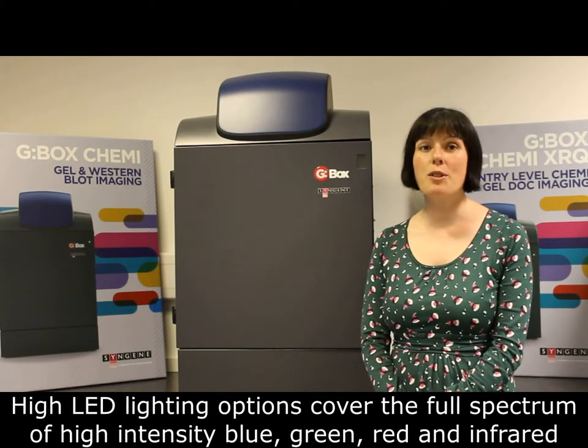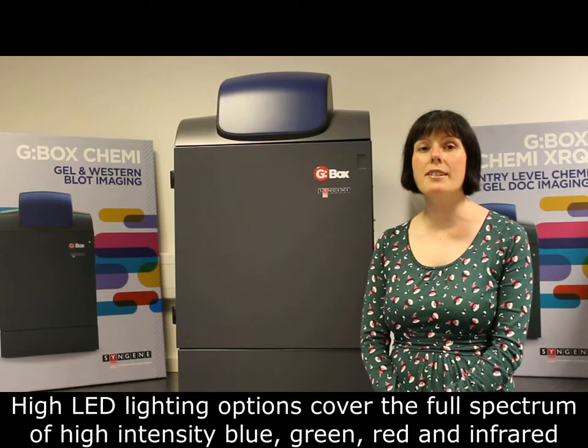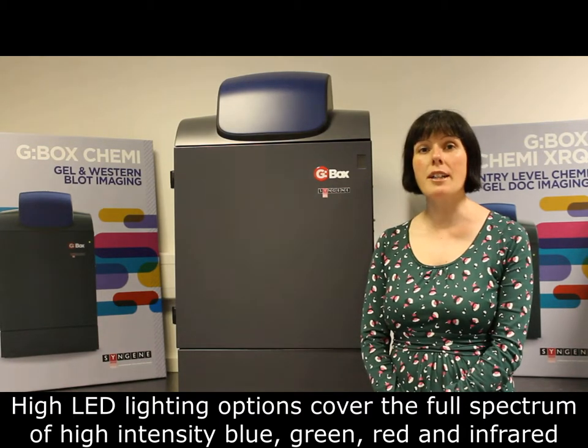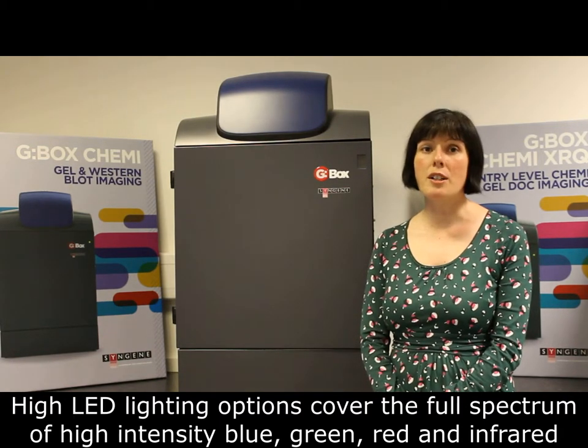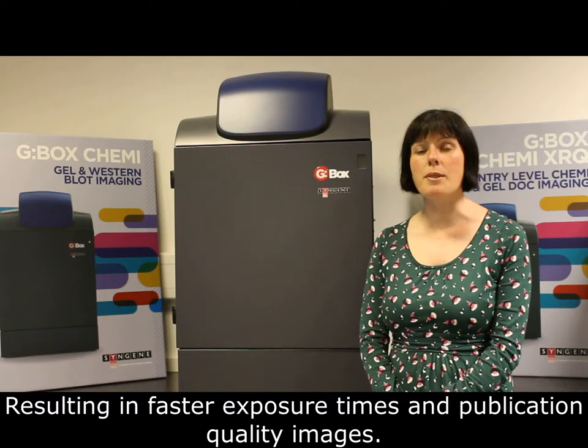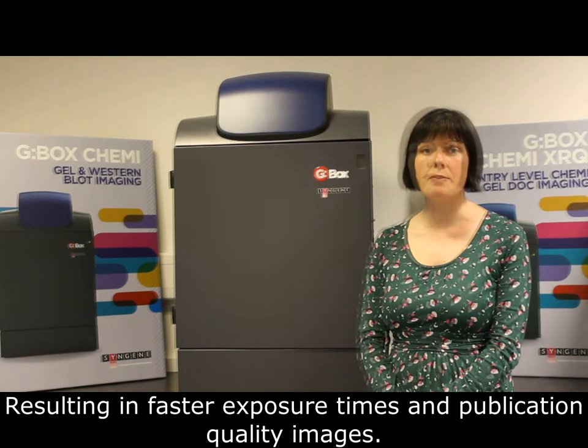High LED lighting options cover the full spectrum of high intensity blue, green, red and infrared resulting in faster exposure times for publication quality images.